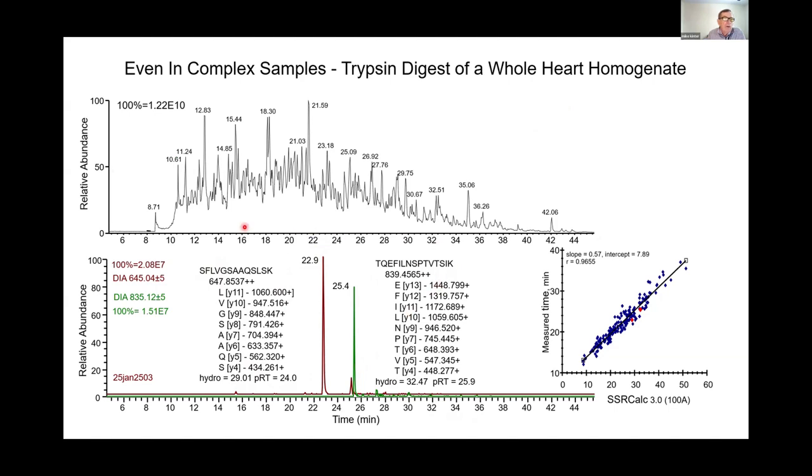All of it's based on this massive set of data from which we're pulling out very specific mass spectrometry characteristics that are determined by the amino acid sequence of the peptide. And as well as a peptide relates back to the parent protein, this makes a very specific assay for, in this case, acyl-CoA oxidase 1. And you see over here in the correlation where these two peptides show up.